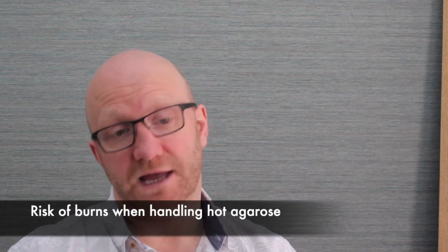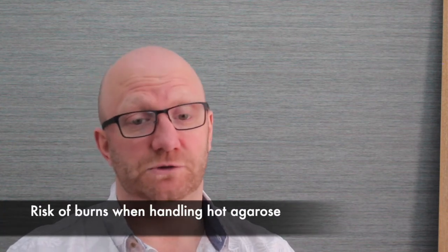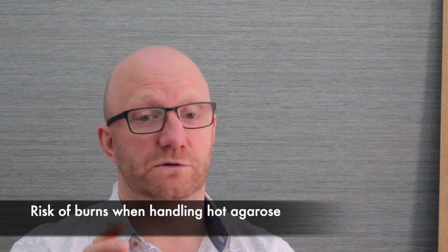First, you'll be heating an agarose solution to boiling point, so make sure you're careful when you remove your flask from the microwave that it doesn't bubble over the top and burn you. So make sure you're wearing the heat protective glove.